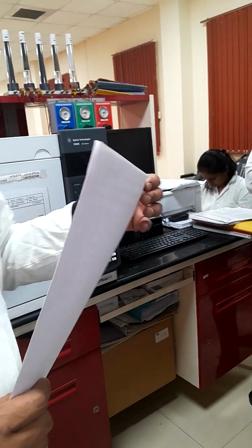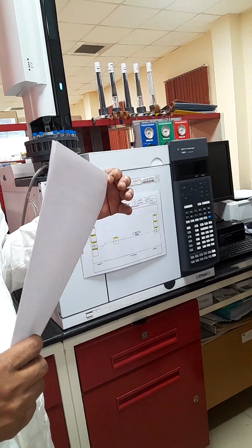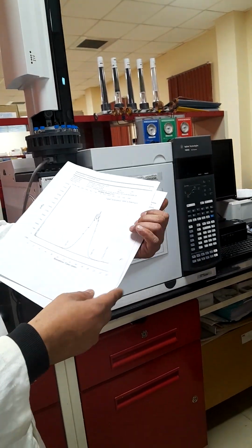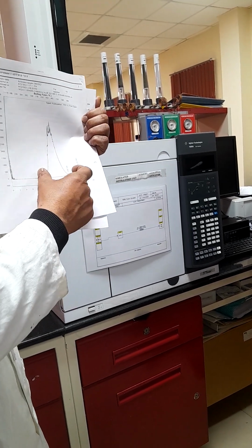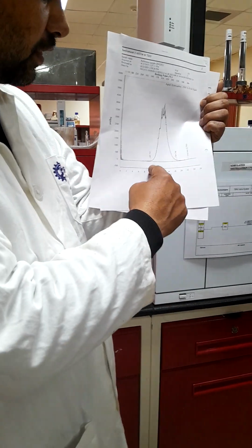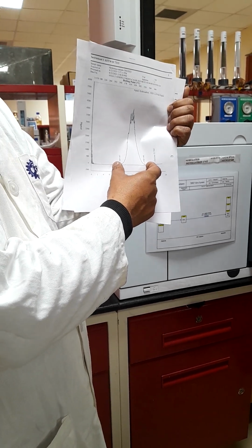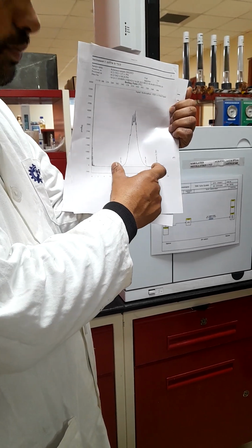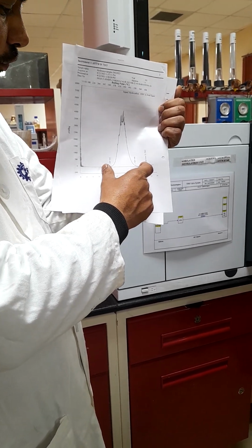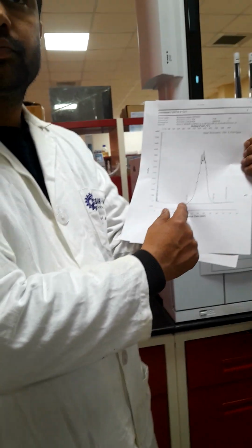But excuse me, you said that the initial boiling point is the 5%. 0.5, 0.5% only of this area. This is a peak area, na? This is the peak, okay, and this is the peak area. This below line is the baseline, not this one. This one is the baseline, okay, and this baseline has the 100% area. This peak area is 100%. If you measure from here to here, 0.5% of this area is noticed as IBP. Yeah, 0.5% only.